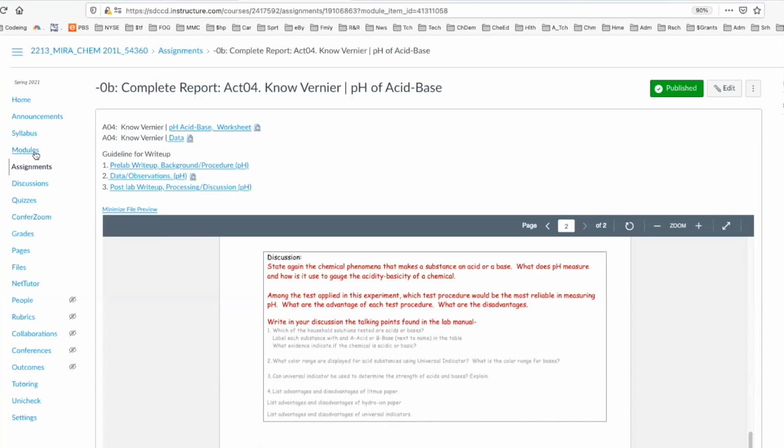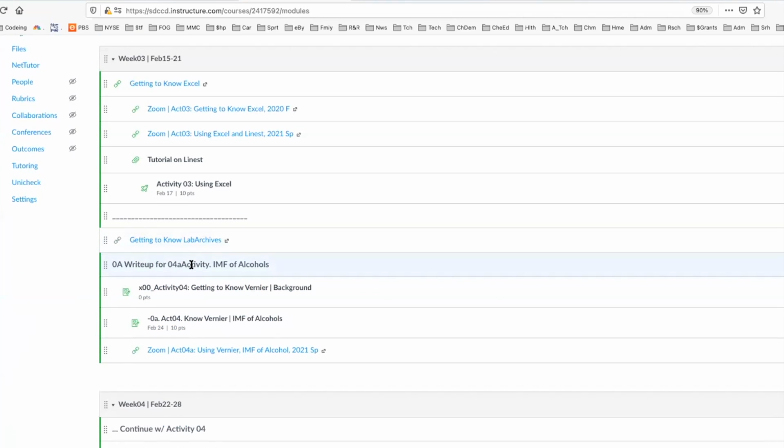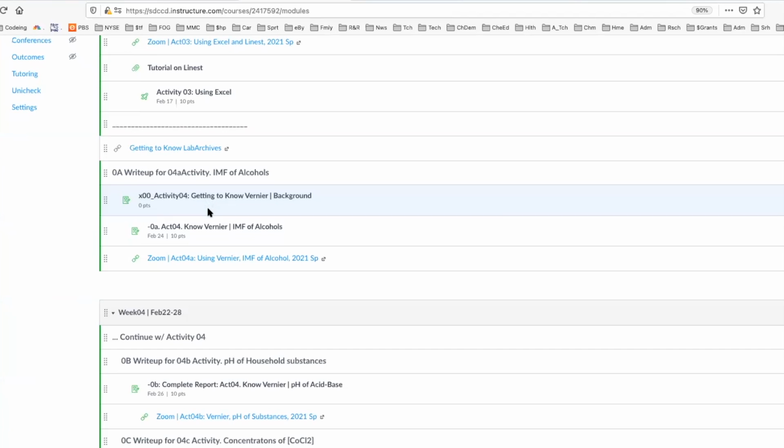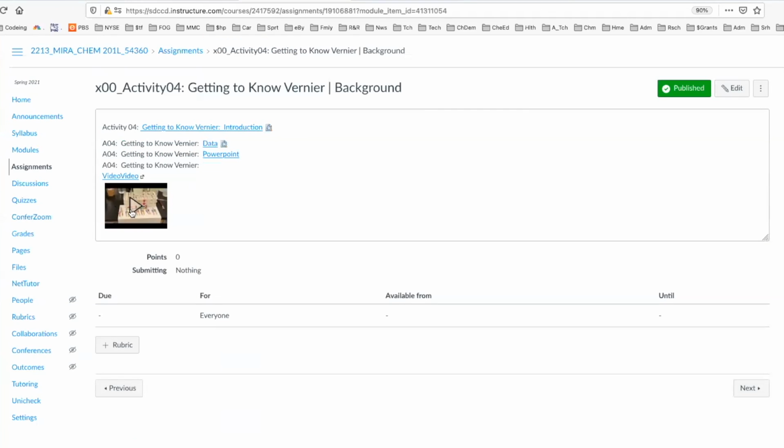Pre-lab. So today we are just going to wrap up Activity 4. I'm just going to show you what I've put in to guide you. Now, if you go back to the module, okay, before we do that, I want to go back to the video of Part C, because I don't think we did that, and I want to give you a little more detailed explanation of it. So we go back over here, and here's the video.